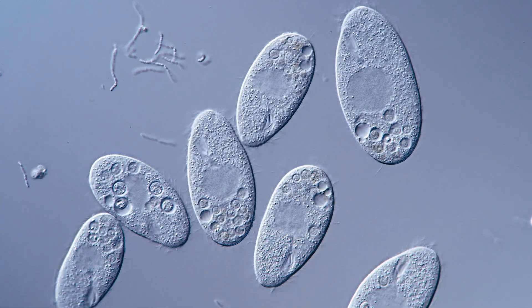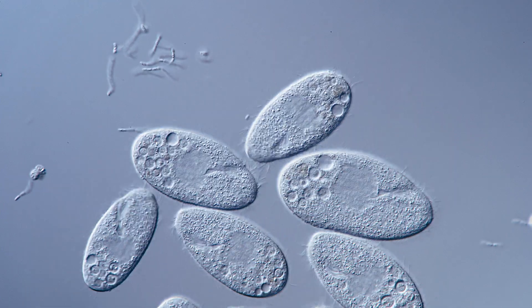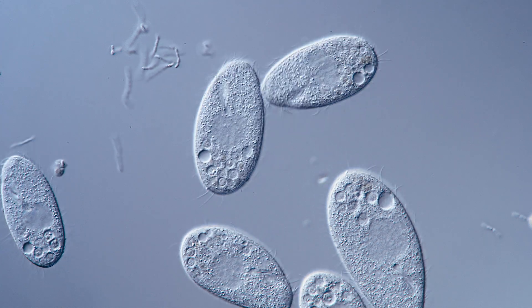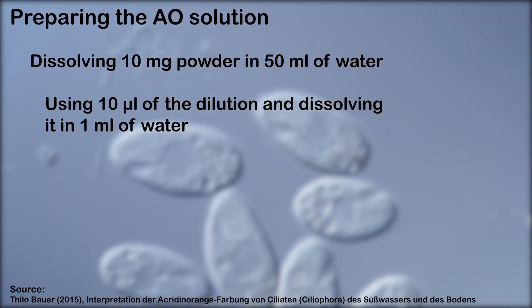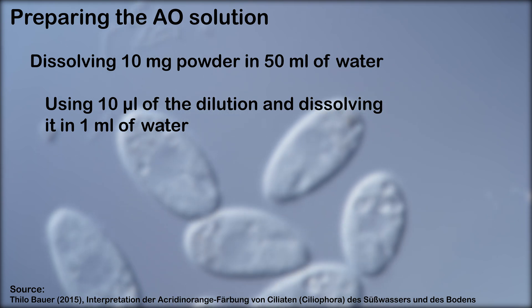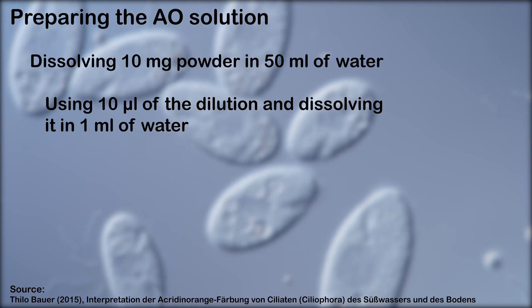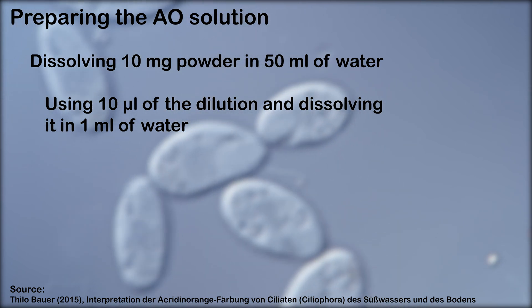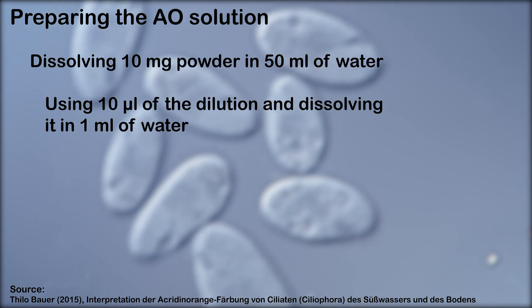Now we need to prepare the AO dilutions. I followed the instructions of Tilo Bauer, a German researcher that often uses this staining for his own research on ciliates — a link to his article is in the video description. First we weigh 10 milligrams of acridine orange and dissolve it in 50 milliliters of water. We then take 10 microliters of that dilution and make a second dilution by pipetting it into 1 milliliter of water. This is the final working AO dilution used for staining.